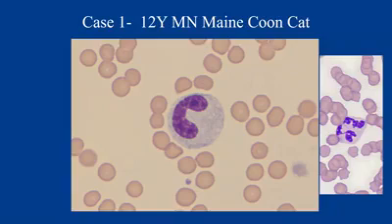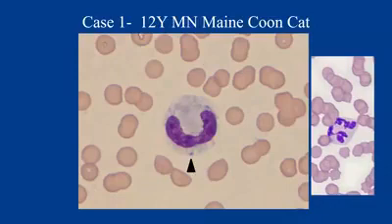Something that's a little bit harder to see sometimes with bands is their chromatin tends to be a little bit less clumpy and mature, and they may be slightly larger cells than segmented neutrophils, but again, those are slightly harder characteristics. Here's another cell, okay?